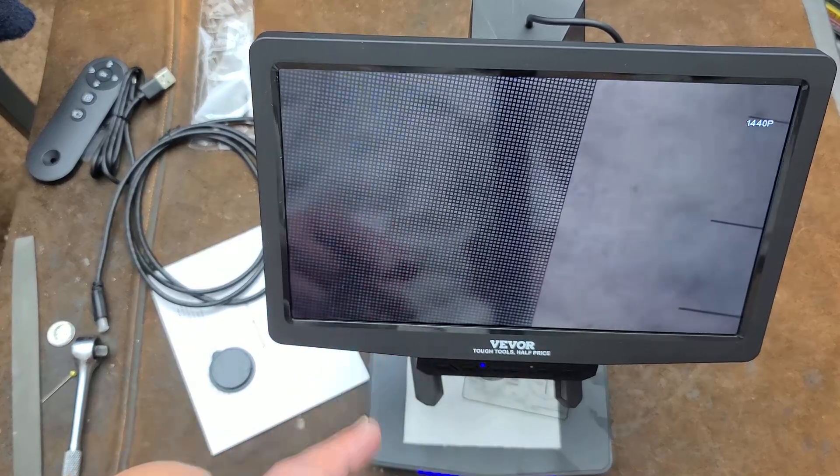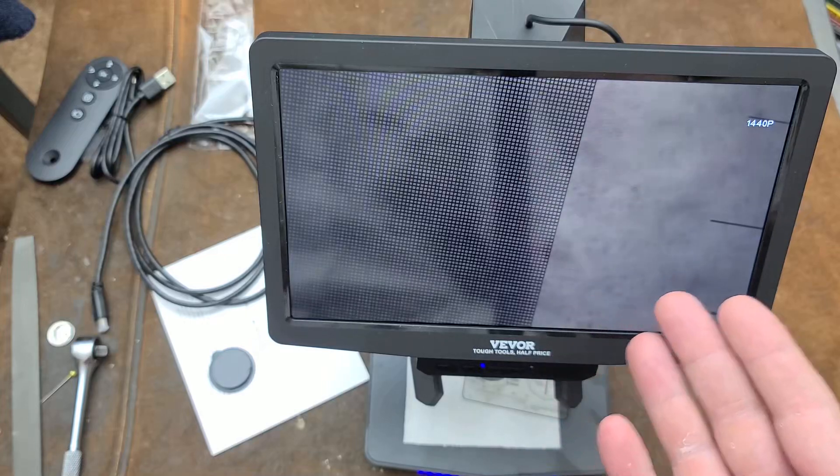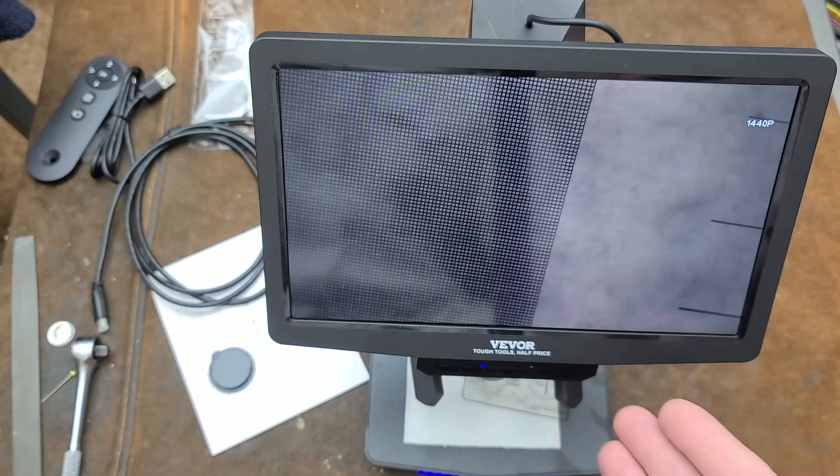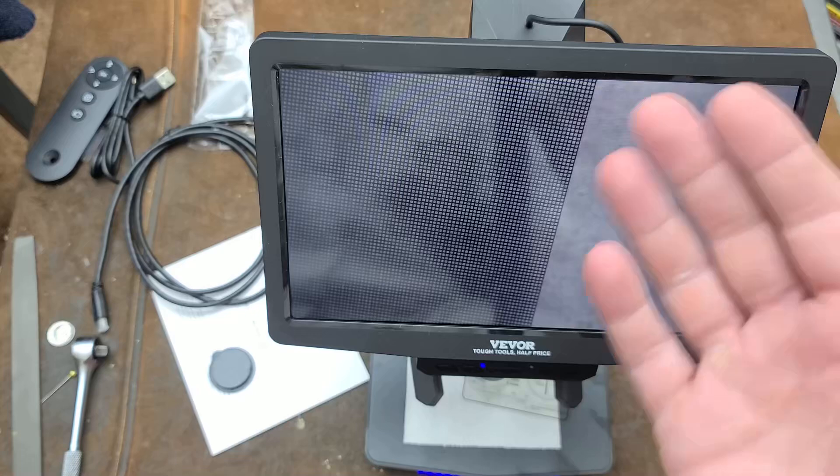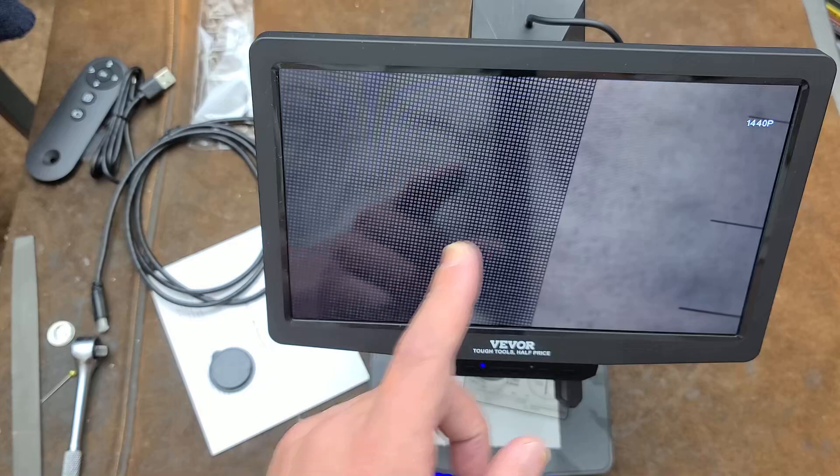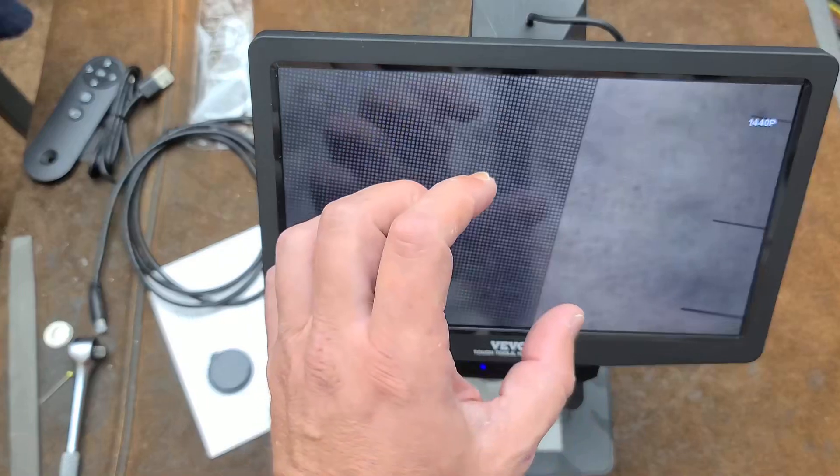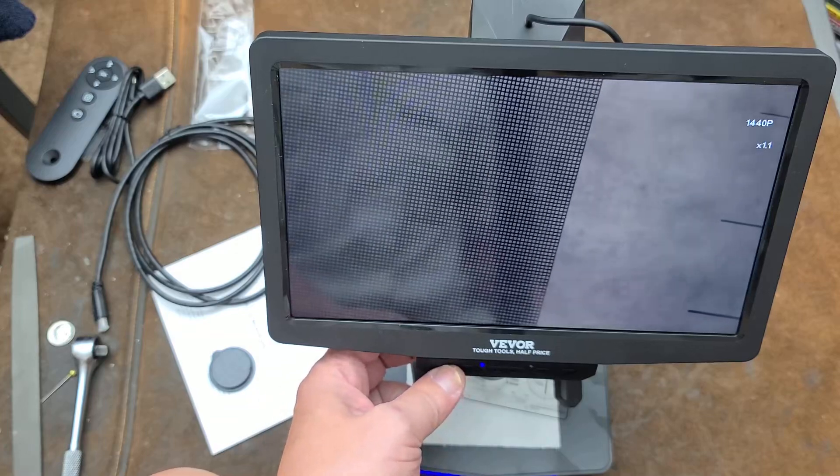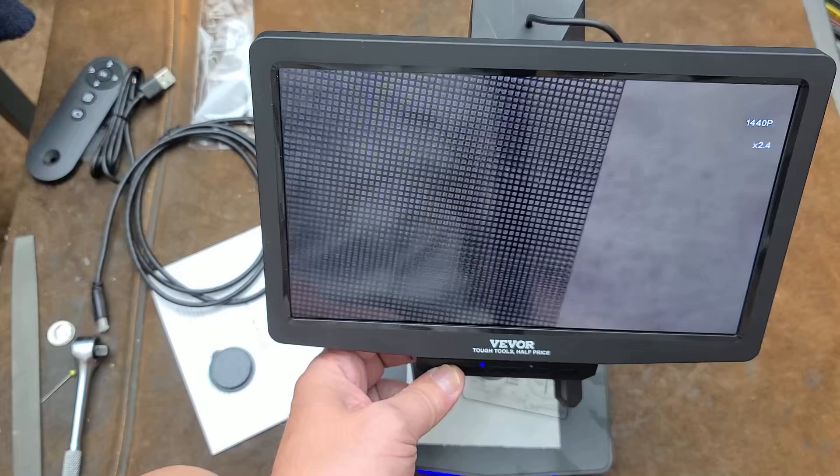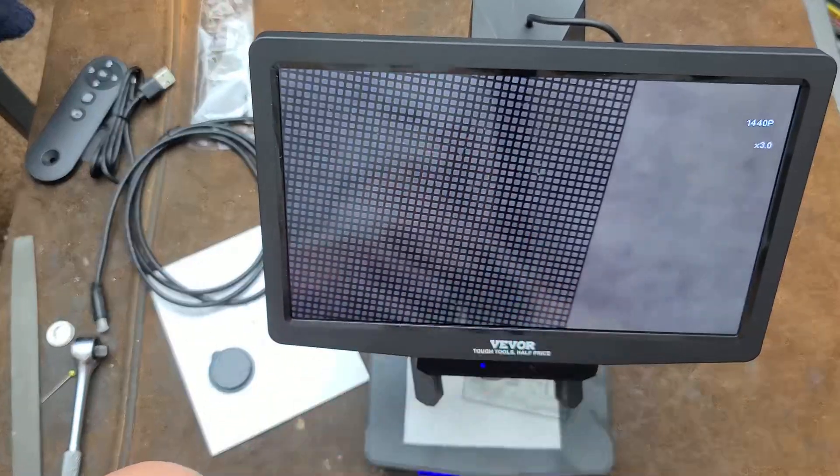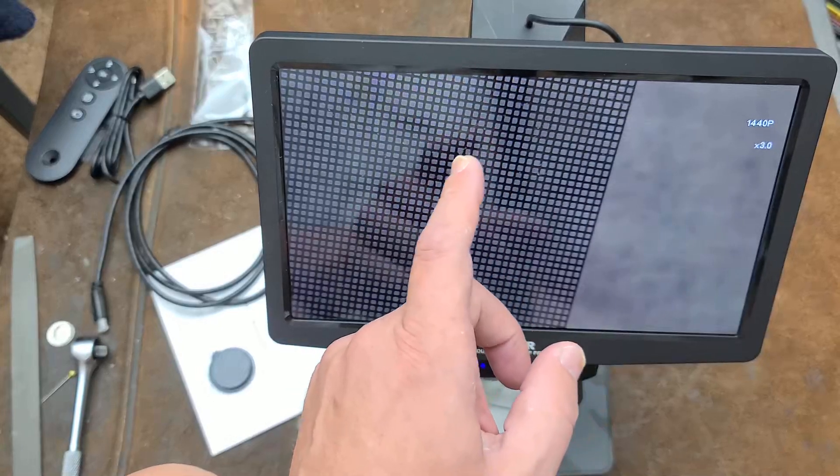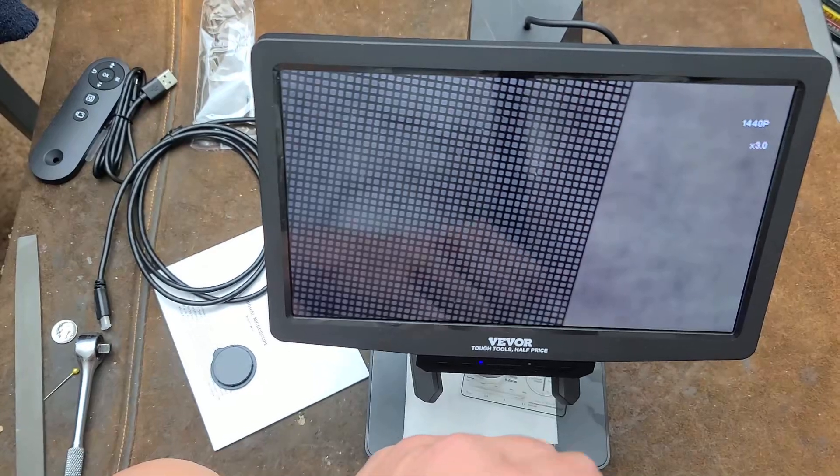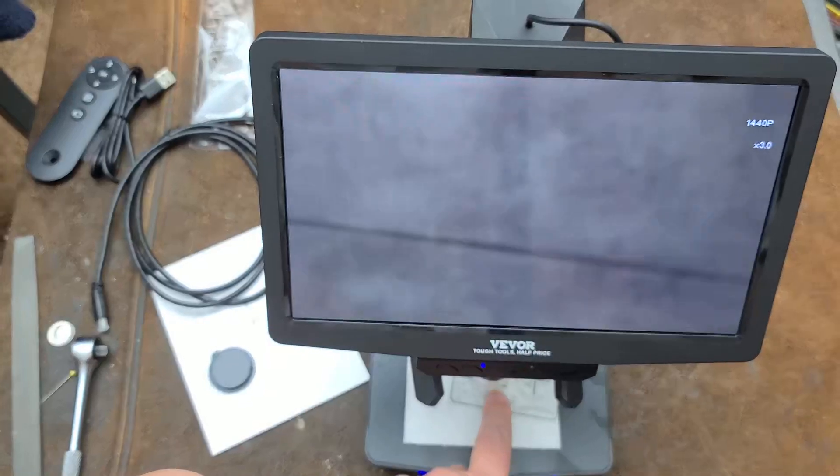It's supposed to have an IPS screen. Everything that you've been viewing so far has been without any of the backlights. This is just the light that it's able to pick up from my table lights for doing these videos. Now we can see that test pattern is using up a much bigger section of the screen. That's where a lot of the zoom comes from. Then we can get into the digital zoom and overall it's not too bad. We can really figure out this pattern here. This is one-tenth of a millimeter, that is the size of those squares. So ten of these little squares is one millimeter.